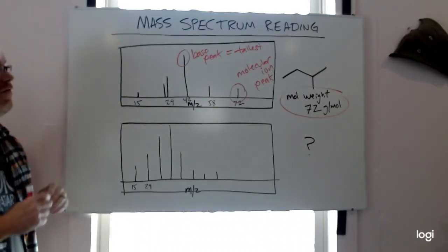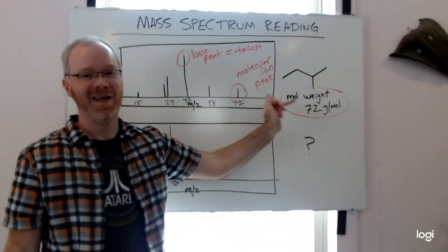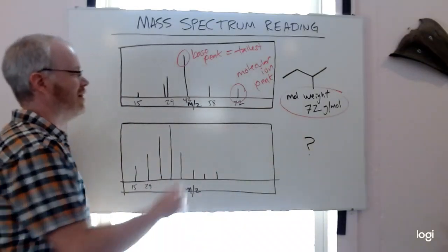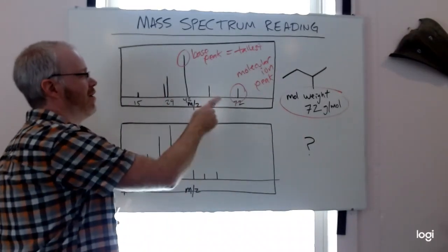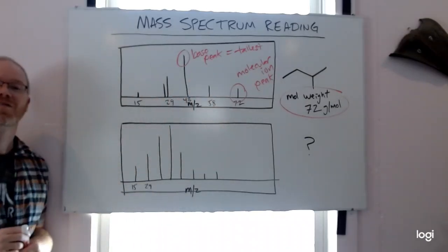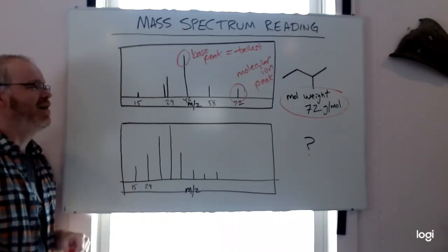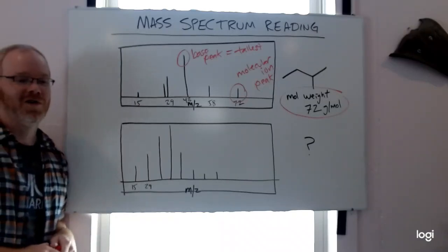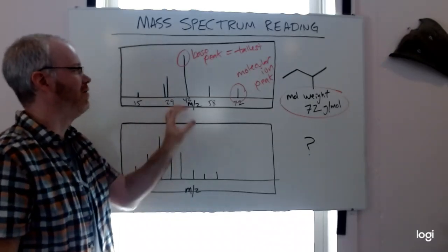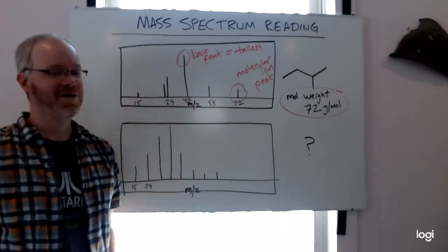And if you figured out the molecular mass of a compound, that limits it to a very few things, and then we can look at the details either by comparing spectrum to known spectrum or looking at fragmentation patterns and what we might expect for something like a hydrocarbon, and you can actually figure out unknowns from there. The vast majority of chemists in a quick way will match spectra to known, but there's a ton of detail we can get out of these.